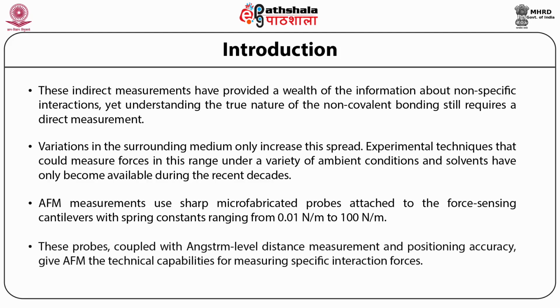These probes, coupled with angstrom level distance measurements and positioning accuracy, give AFM technical capabilities for measuring specific interaction forces a great advantage. However, the utility of the standard AFM setup for measuring specific forces is severely limited by the unknown chemical composition of the AFM tip.